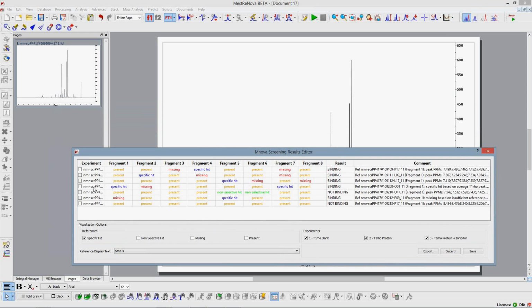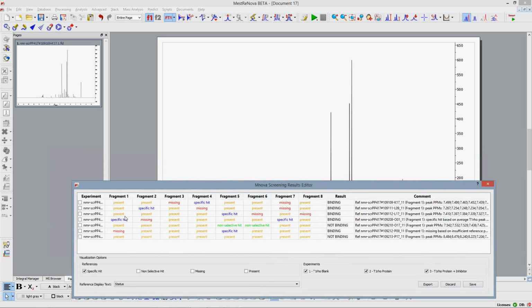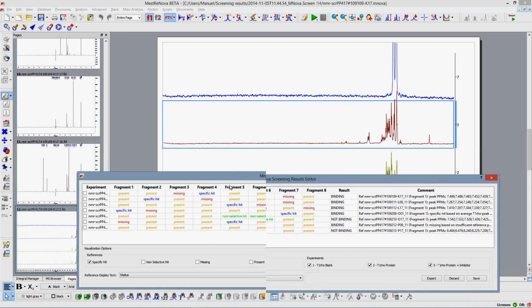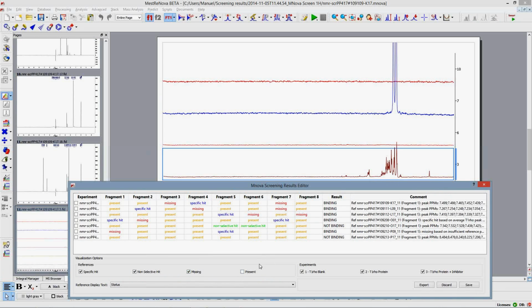Now, we have an overview of what the results would be for these specific samples, but we also have, like I mentioned before, our viewer in front of us. From this viewer, we can go sample by sample, and every time we double click on one of these, it is going to open for us. In here, I'm going to be able to display only the information that I'm most interested in. So in this case, let's go step by step.